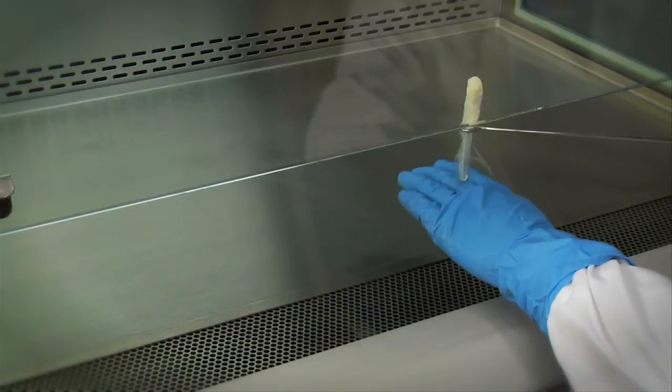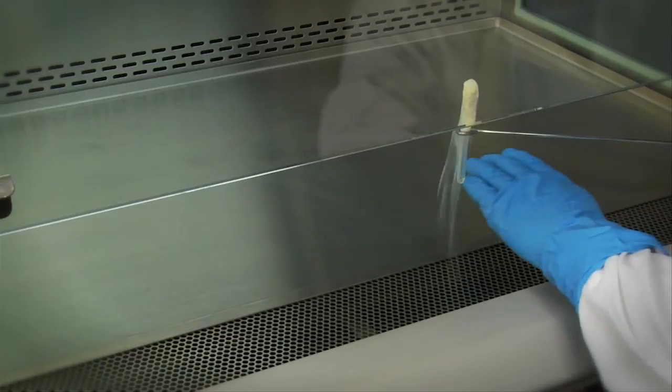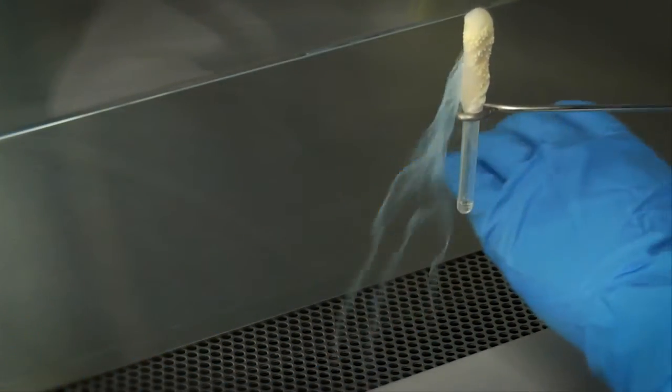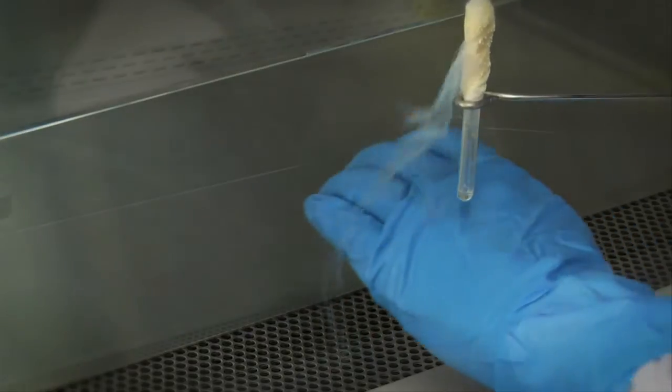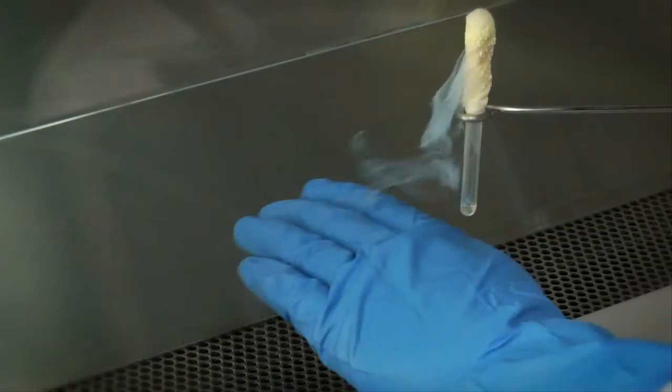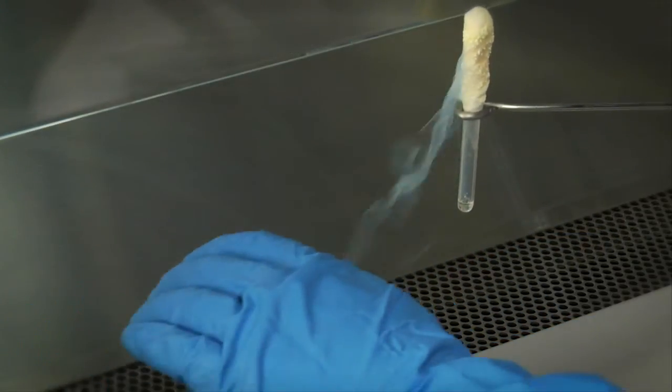The rapid movement of a worker's arms in a sweeping motion into and out of the cabinet will disrupt the air curtain and may compromise the partial barrier containment provided by the BSC. Moving arms in and out slowly perpendicular to the face opening of the cabinet will reduce this risk.